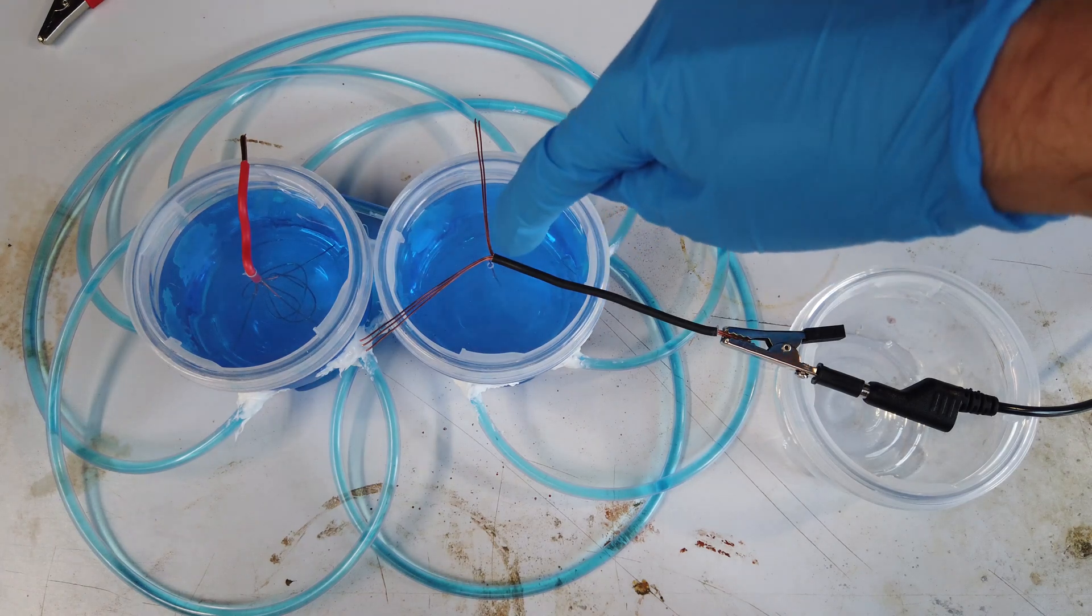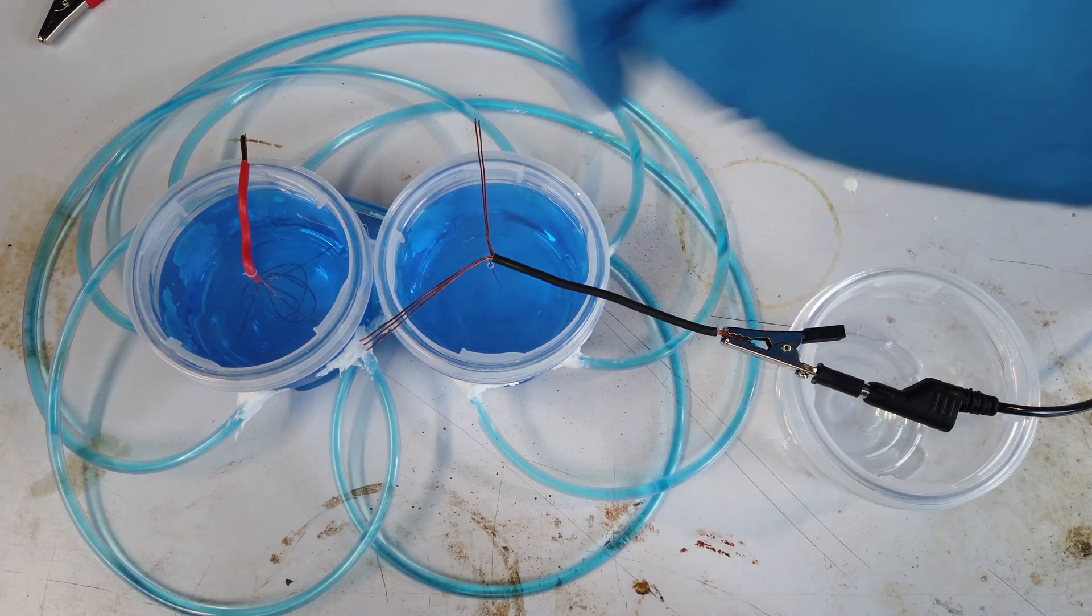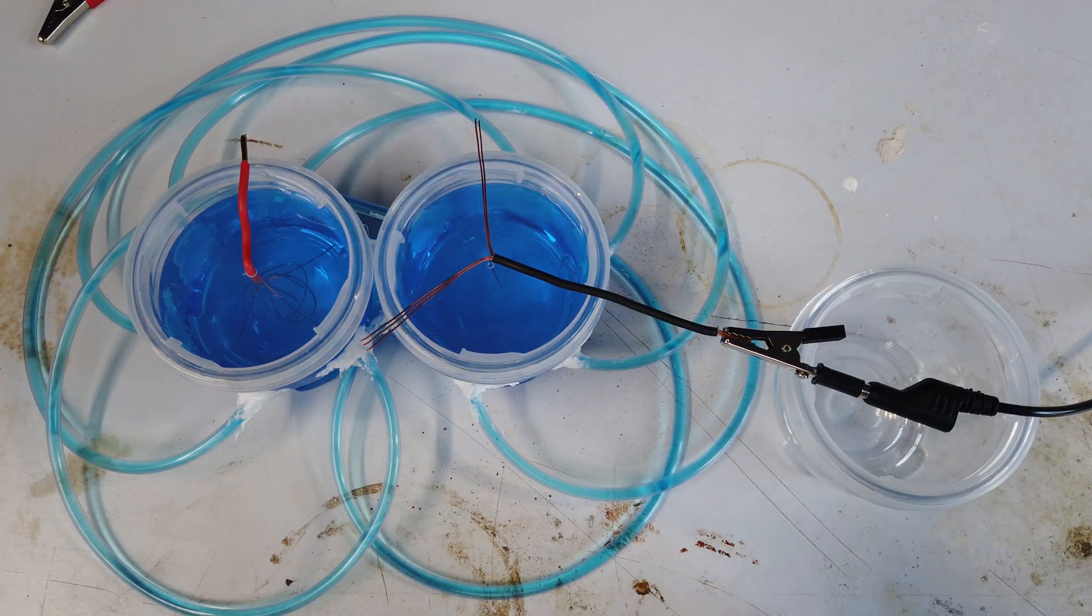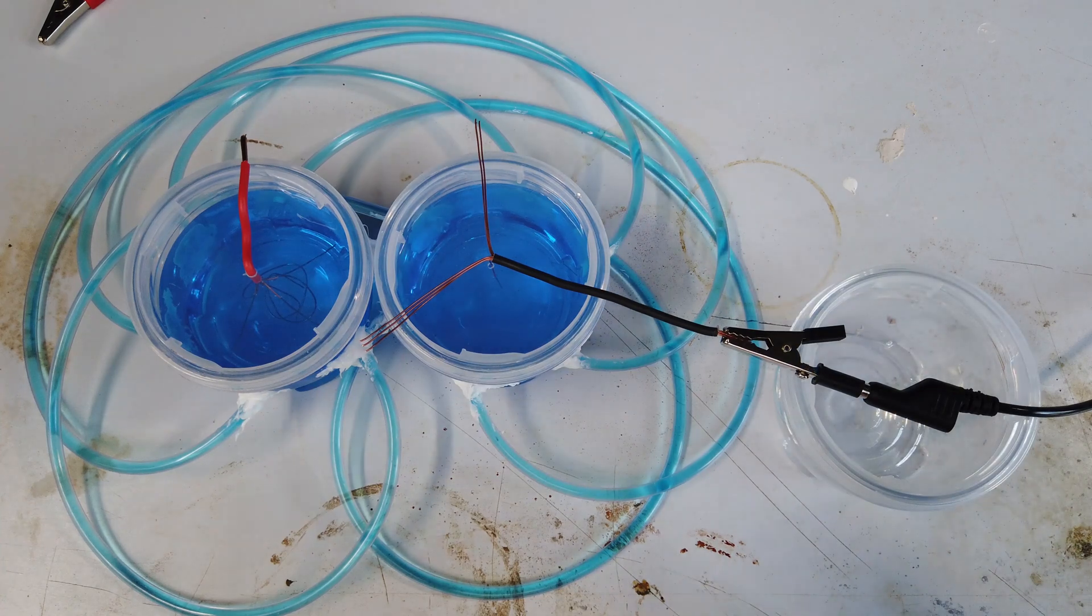We have our electrodes in there. This is the cathode, this is the single wire that will grow our nice copper crystals, hopefully.